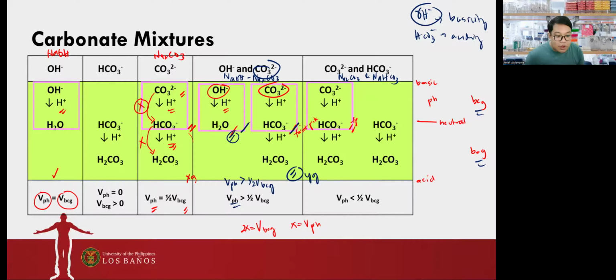Whereas, when we make use of the bromcresol green indicator, ayan. So, itatitrate niya lahat ng carbonate to bicarb from the carbonate ion, then lahat ng bicarb to carbonic acid. Additionally, yung mga bicarb na present from the sodium bicarbonate will be titrated using the standard acid until all bicarb ions are converted to carbonic acid. And kapag na-kompleto itong dalawang ito, dun pa lang natin makikita experimentally si yellow-green endpoint. Okay?